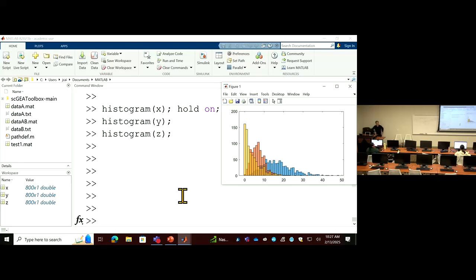Now I'm going to write a small script. A script is a combination of several lines of code put in a file. So next time you can run the script file instead of typing that in again and again. I will combine what we have tried to simulate 3 genes expression in 1,000 cells to make a 3 by 1,000 matrix as my simulator.